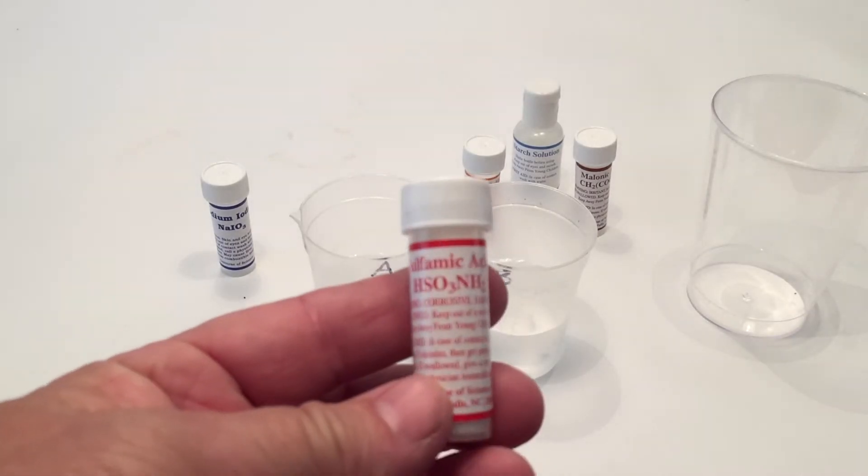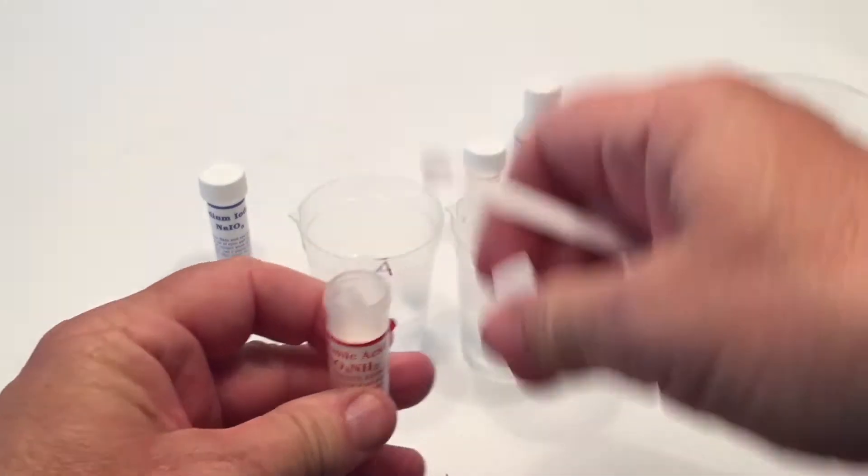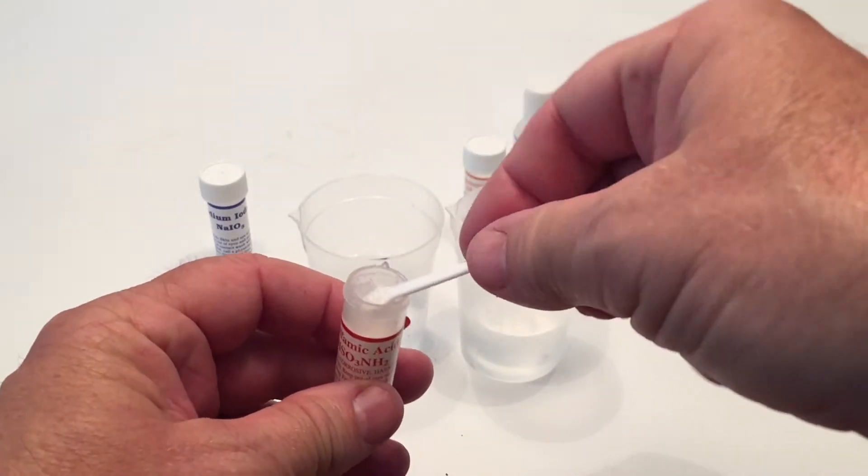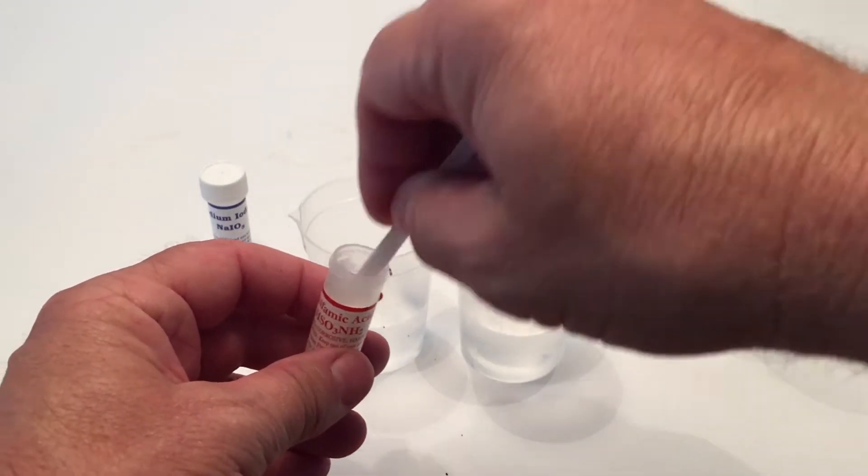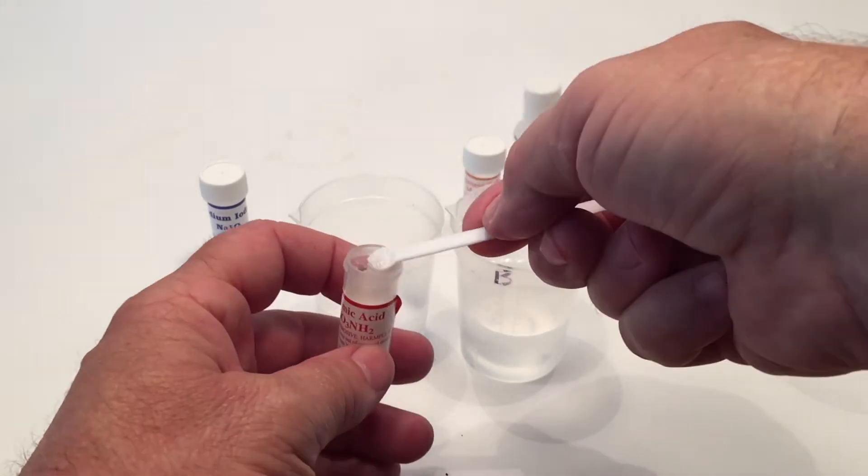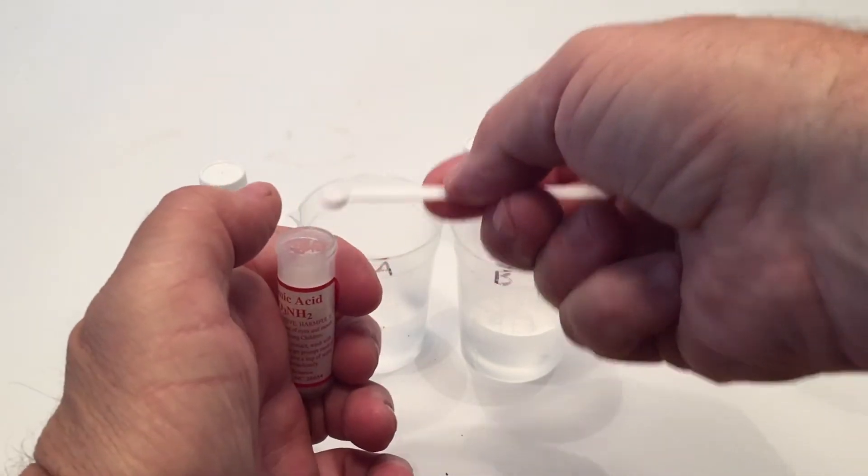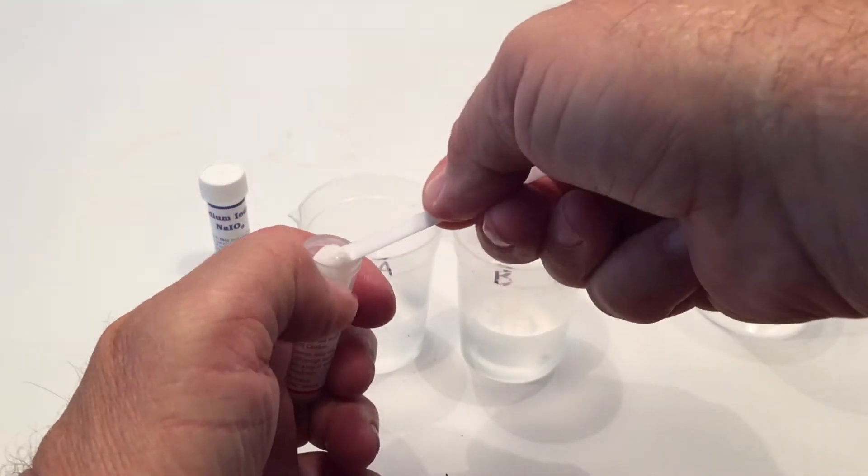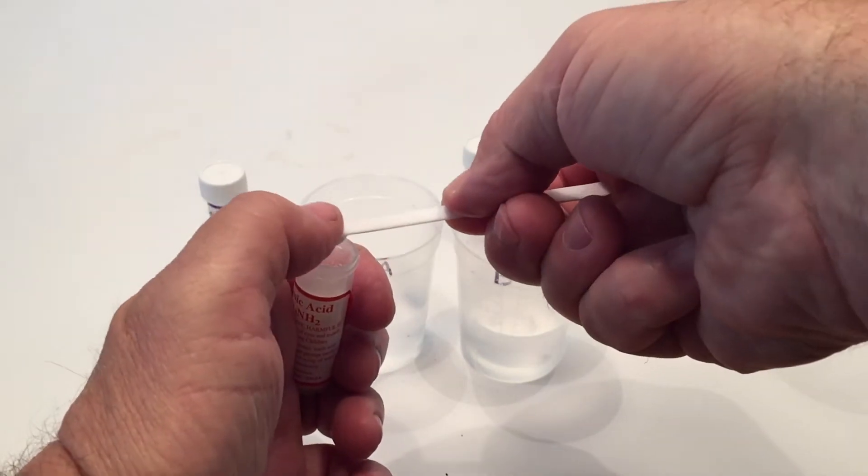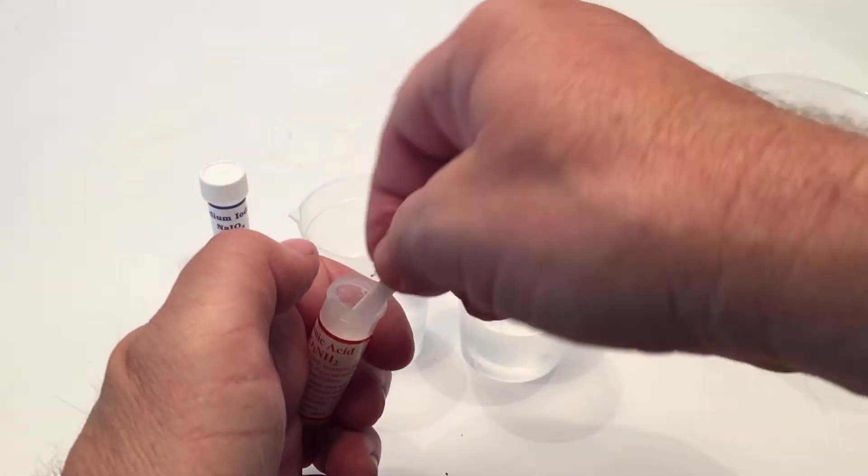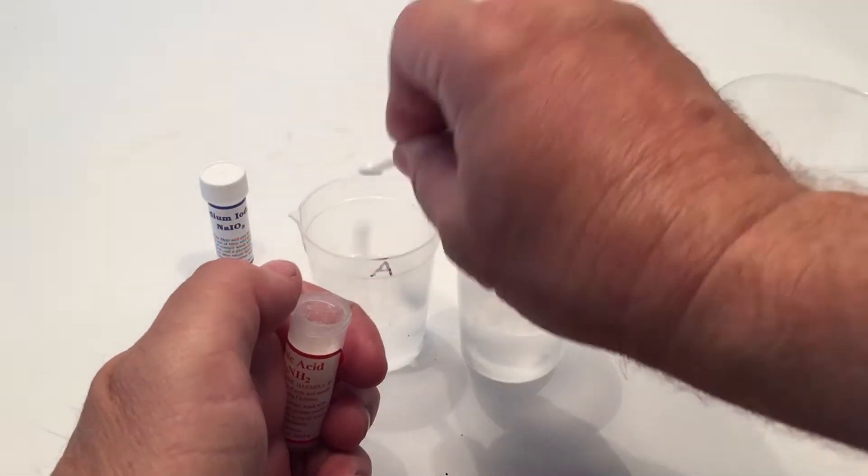Now in cup A, we're going to put sulfamic acid. We're going to put four of the little scoops. The scooper comes with the kit. So we're going to put four of these scoops, kind of level it out if you need to, and you put four of those in solution A only. And that was the distilled water that was in A.